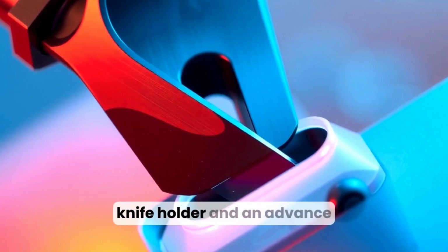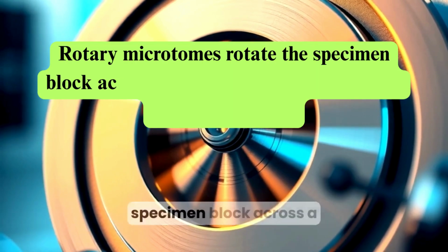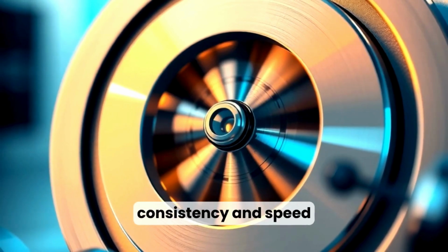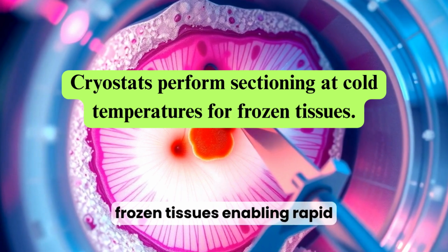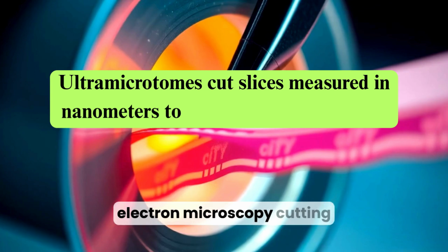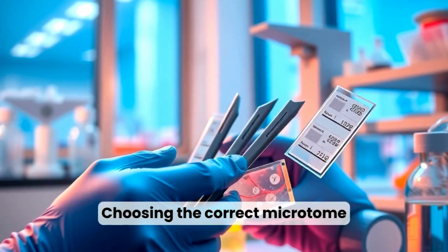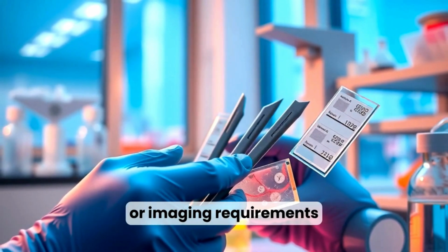The core components include the blade, specimen holder, knife holder, and an advanced mechanism that moves the block towards the blade. Rotary microtomes rotate the specimen block across a stationary blade for routine paraffin sections, offering consistency and speed. Cryostats perform sectioning at cold temperatures for frozen tissues, enabling rapid intraoperative diagnosis and quick pathology turnaround. Ultramicrotomes produce ultrastructural sections for electron microscopy, cutting slices measured in nanometers to study subcellular detail. Choosing the correct microtome type depends on sample hardness, desired thickness, speed, and downstream staining or imaging requirements.